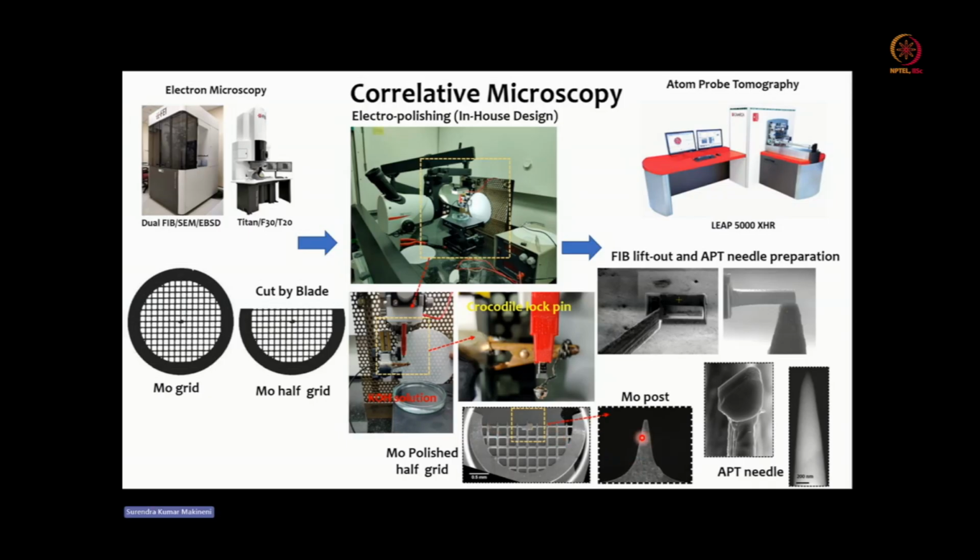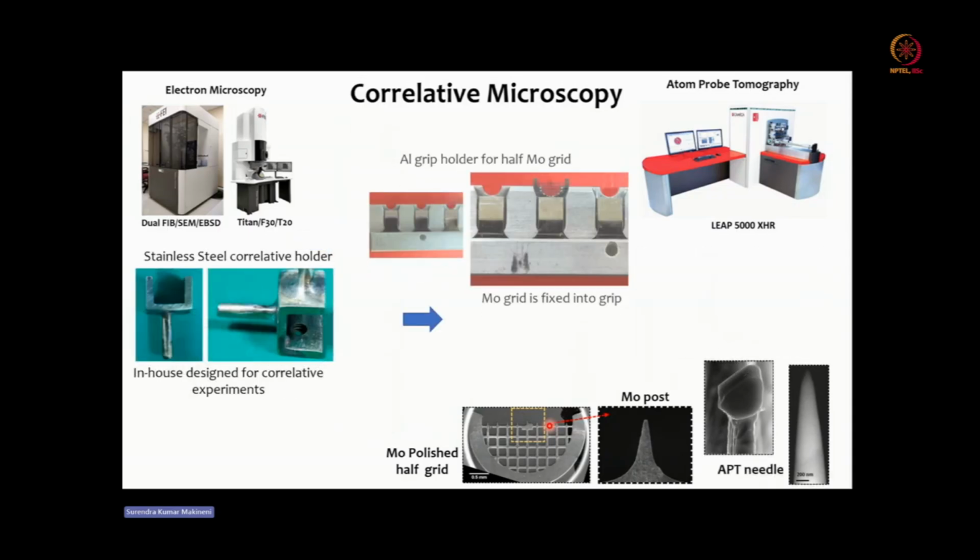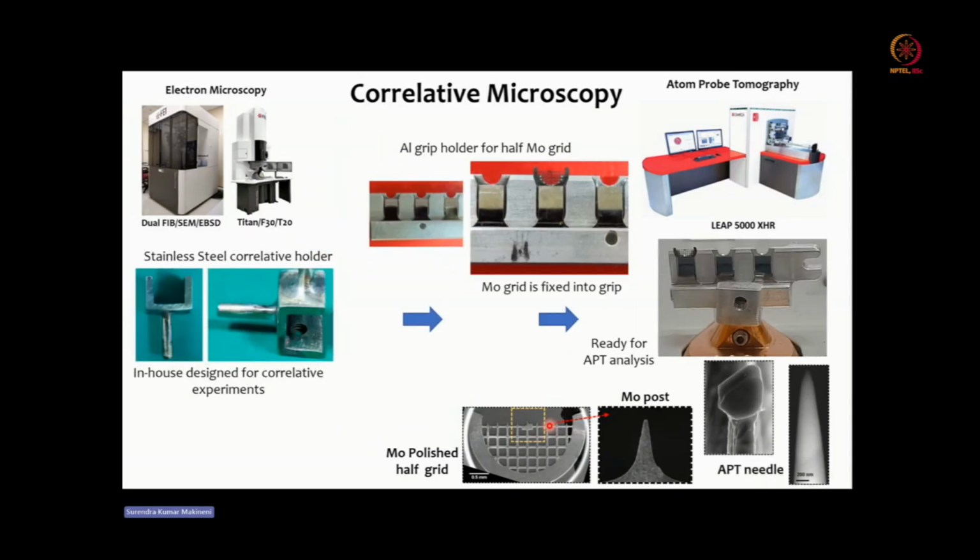And this is the needle, which is the moly post, where the sample can be pasted by using the FIB, and can be milled to get the needle specimen with the sample of interest. Okay, now you have a moly grid with the sample. Fine. Now what we do is, this particular moly grid can directly go to the TEM holder where you can get the structural information.